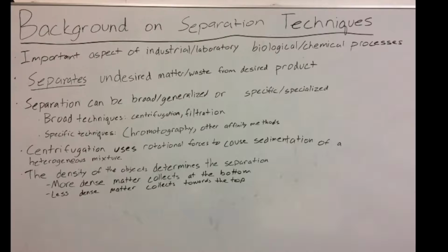One of the many separation techniques is centrifugation. Centrifugation is more of a generalized method of separation, but still can be used for a wide range of different situations and scenarios. Centrifuges have many uses in all sorts of diverse scientific fields, from almost any biological field to doing things like performing uranium enrichment. It uses centripetal force, yes centripetal, not centrifugal, to cause sedimentation of a heterogeneous mixture.